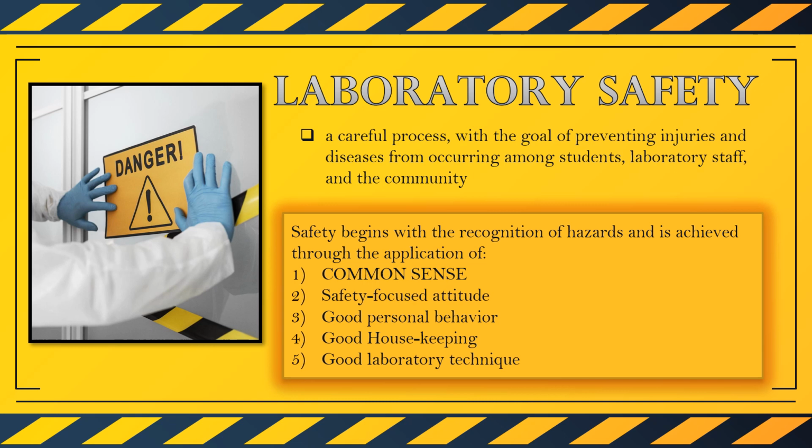So, for example, understanding the risks. Common sense dictates that anyone working in a laboratory should be aware of the potential risks associated with the reagents and chemicals as well as equipments we are handling. Also, when following procedures, common sense dictates that all laboratory procedures should be strictly followed to prevent erroneous results, right? And also wearing of appropriate protective equipments.